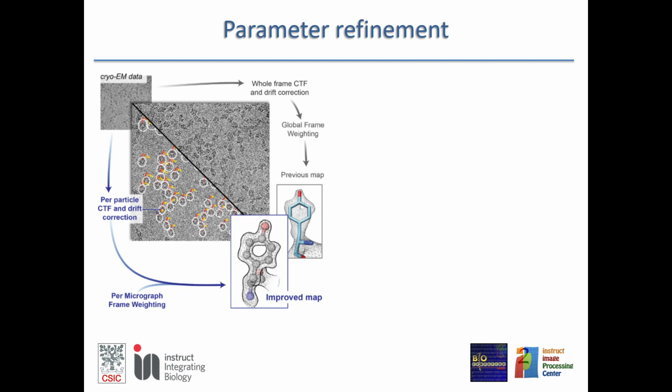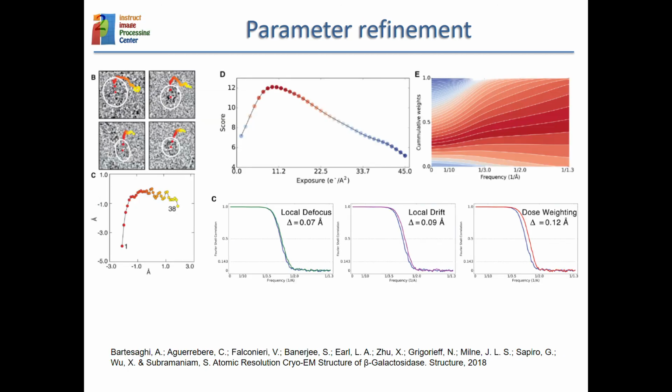So the idea is that you may refine very accurately what is the defocus, what is the frame alignment. Frame alignment would be changing B, the defocus would be changing A, and then you iteratively find better alignment of the frames and better CTF defocus based on the current estimate. So it is estimating A and B at the same time as you are iterating.